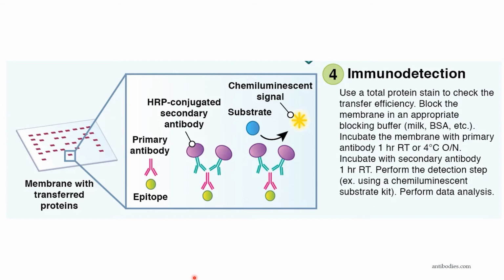What we're doing is we try to stick our primary antibody on our target protein. And the milk, the blocking buffer, we use it to block the other proteins that we don't want to detect. So we incubate it for an hour or overnight, depending on the protocol or how finicky your target protein is. And then you put away the excess solutions, and then you pipette in your secondary antibody. It will bind to your primary antibody. The secondary antibody then will luminesce, meaning it will show up on the machine.